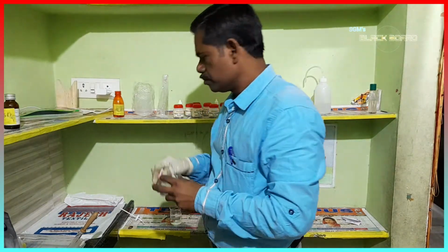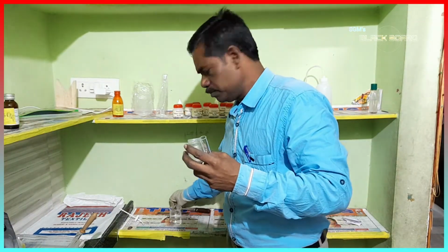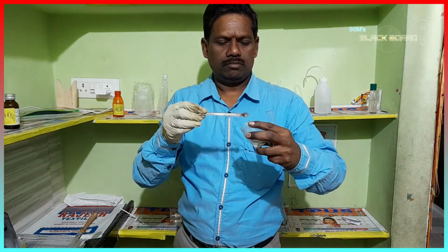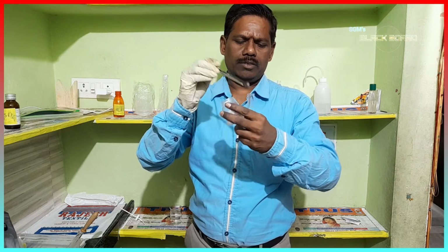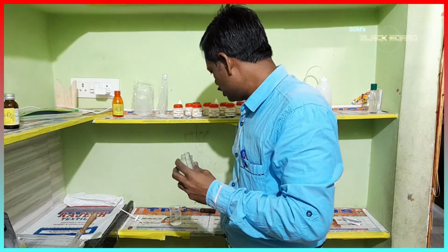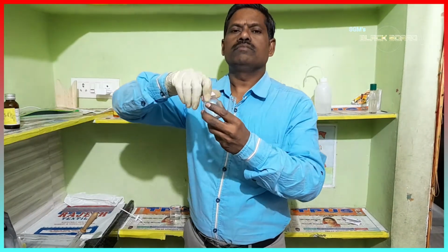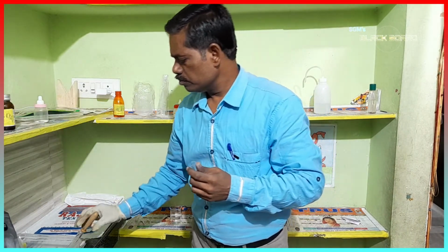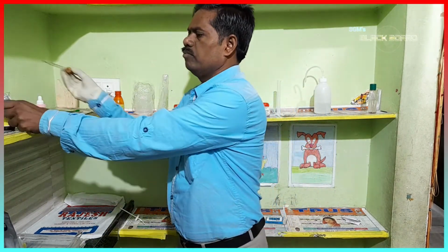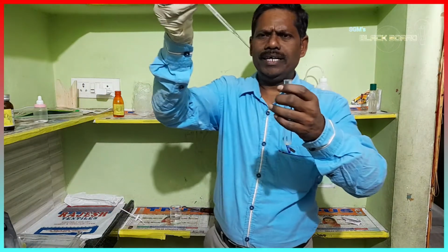First of all, I am taking a very small quantity of sodium chloride in a test tube, only 0.5 grams. Now let us take sulfuric acid. Here I am adding a small quantity of sulfuric acid.